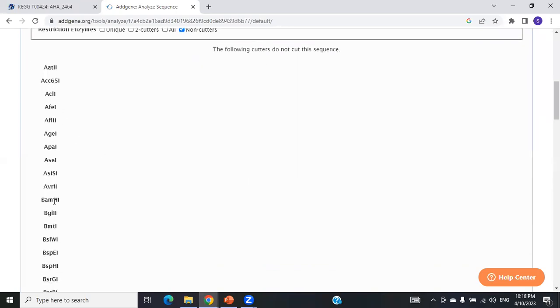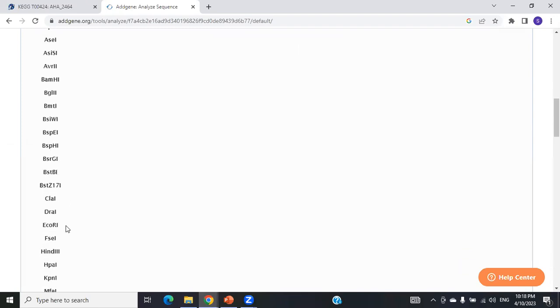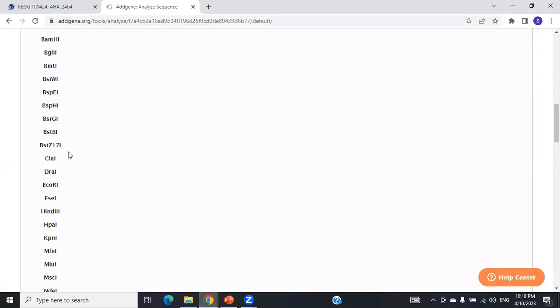I can see BamHI, EcoRI, HindIII. I cannot see EcoRV in the list. NdeI.